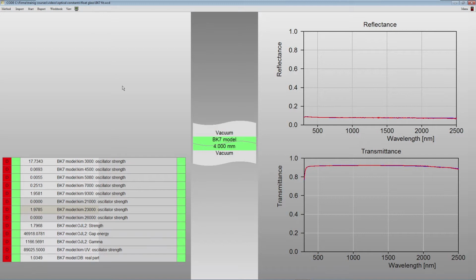I would like to start with this configuration here that we developed when we were discussing transparent glass substrates, and this was the last fit for the BK7 substrate. And on top of the substrate I have data for deposited oxides, two different types of oxides, one with large refractive index values, the other one with rather small ones. We will see how these materials differ from each other.